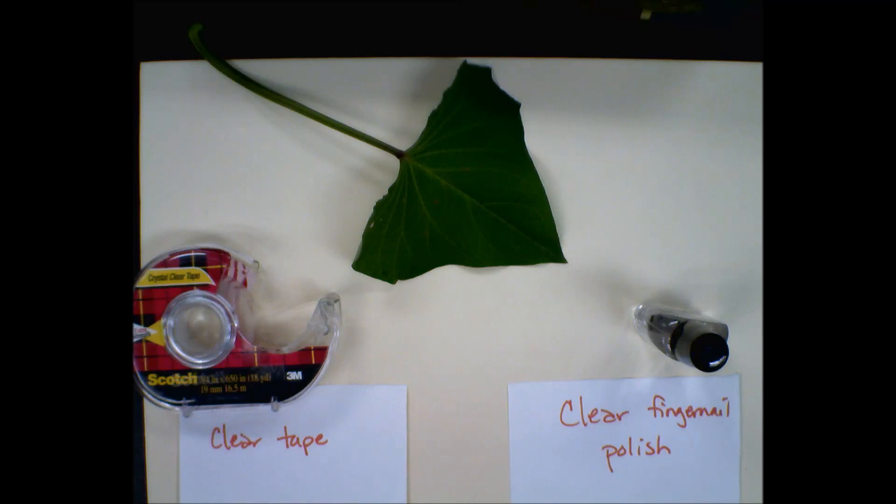This is a different type of slide that we're going to learn how to make and it's called making a cast. What we're going to do rather than look at a whole depth of a cell, we just want to see the surface, and to do that we need to make a cast.